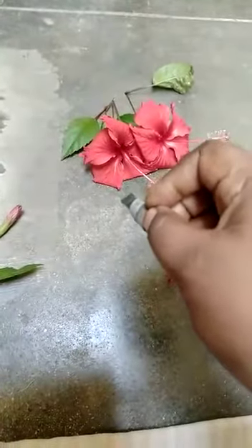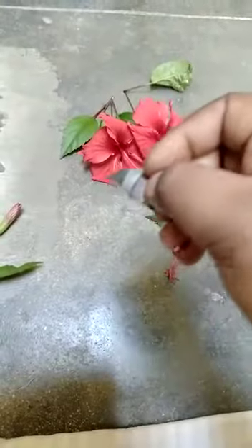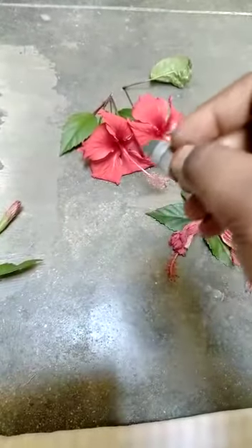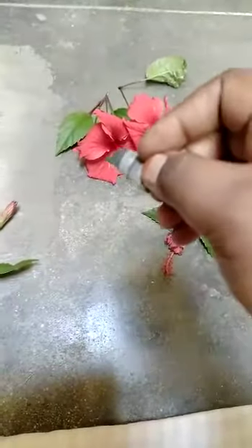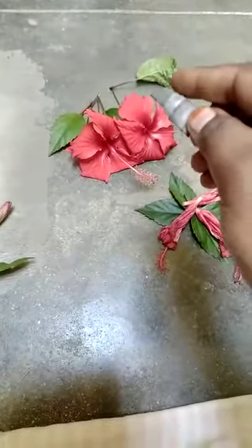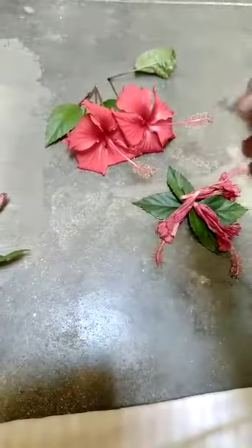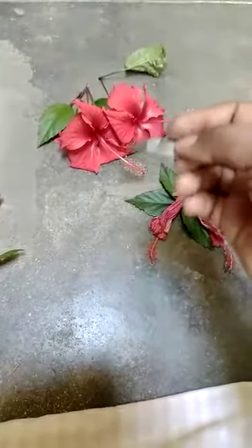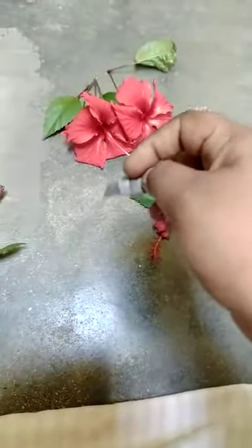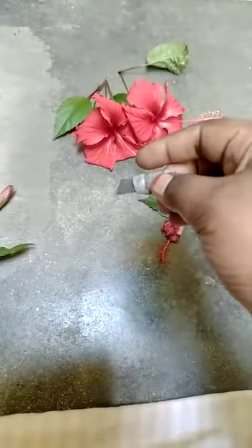Students, please don't do this individually. Accompany your parents and do these experiments under the surveillance of your parents, because you are using a blade. So be careful, and if you don't know how to do this, please have the help of your parents. Let's start the dissection of the hibiscus flower now.